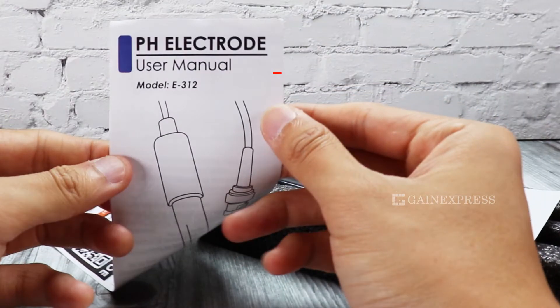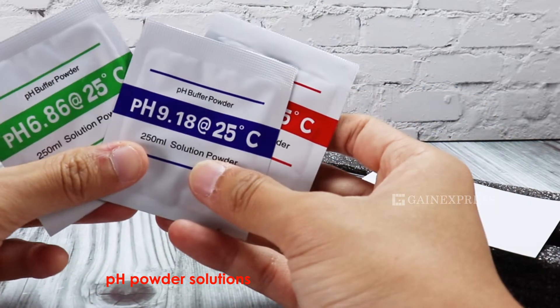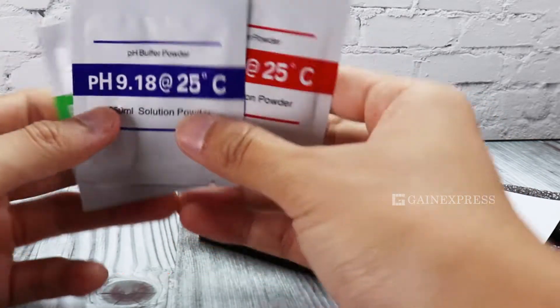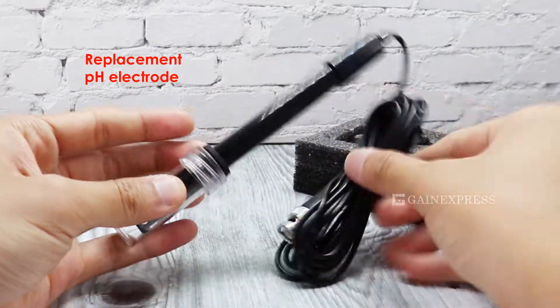The set includes our User Manual, pH Powder Solution, pH Power User Guide, Storage Bottle, and pH Electrode.